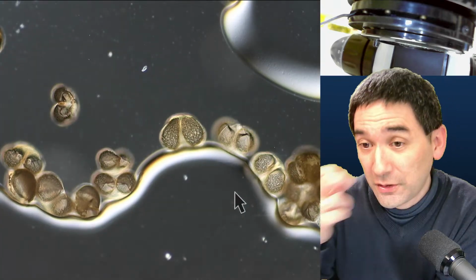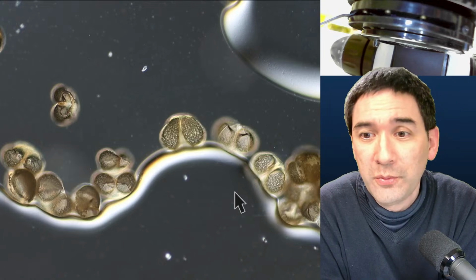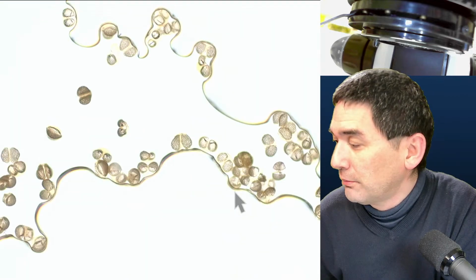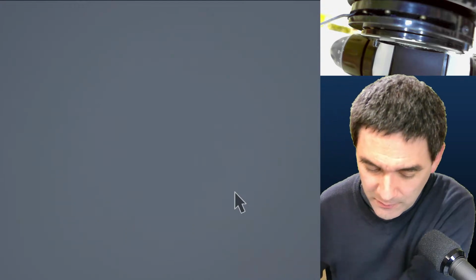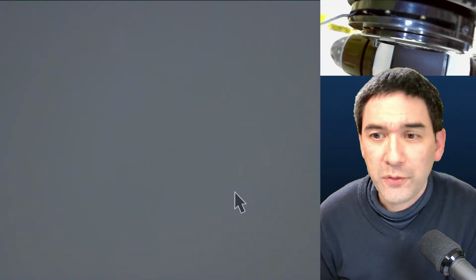And what I would like to do now is put it over into my other microscope, and we're going to have a look at these things using darkfield. Okay, so let me take it out again, and I also have some water samples prepared as well, so that we can look at a few live organisms.